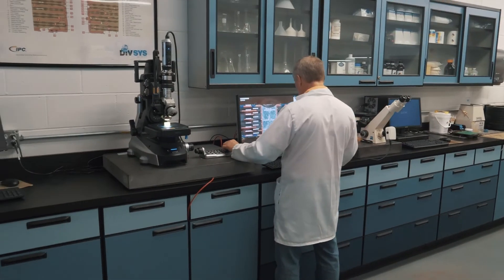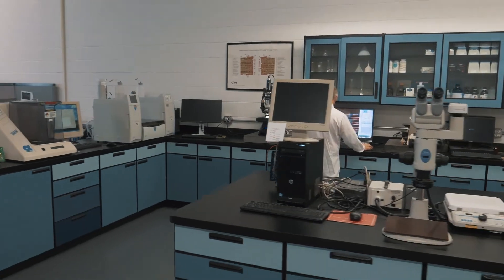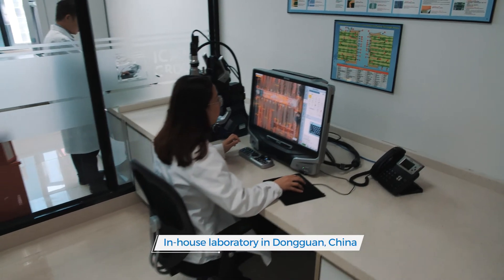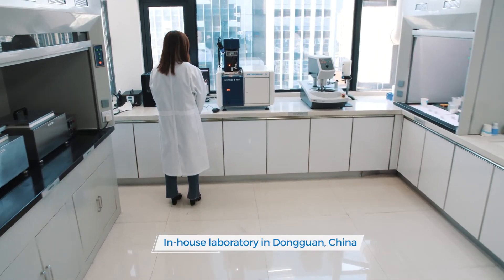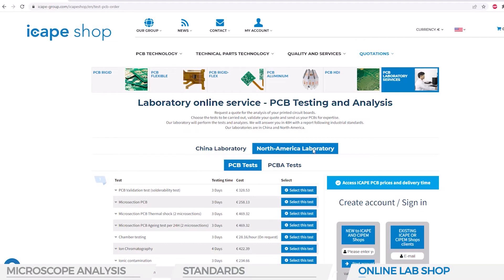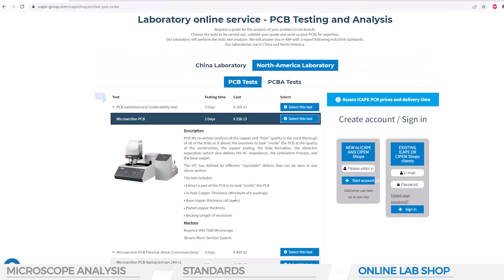This microsection analysis can be performed at either one of our two in-house laboratories — at our US lab, but also at our own lab in China, near our Asian partner factories. This laboratory service is available directly online at our lab shop site. For more information, contact us directly or visit our website.